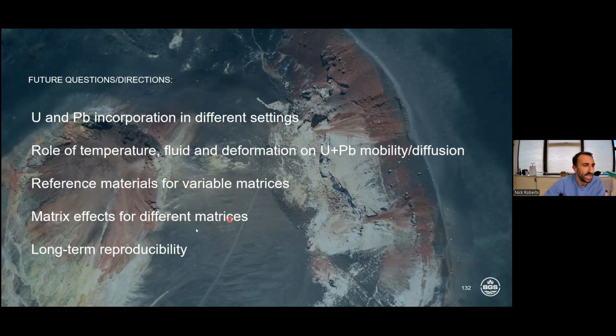And there's still some way to go on understanding long-term reproducibility. So if you just take an age out of the literature, how reliable is that? If you measure the same carbonate on a different day, we can get the same age basically.